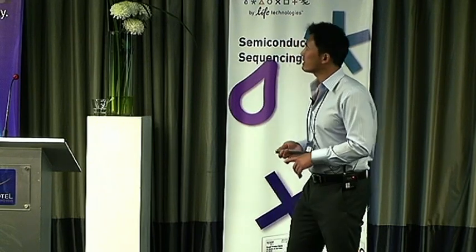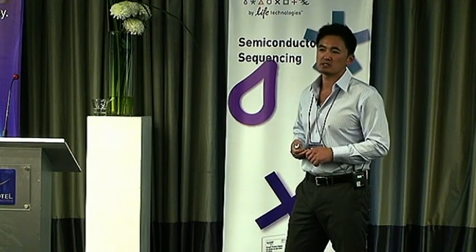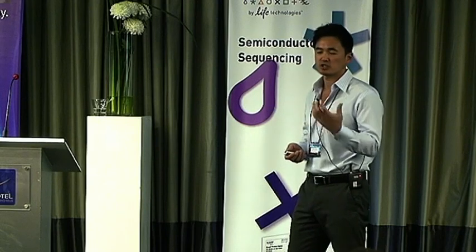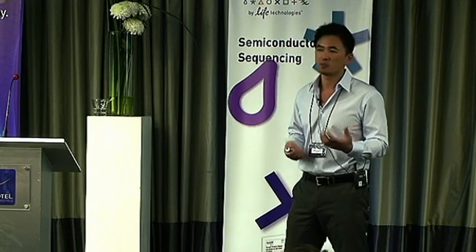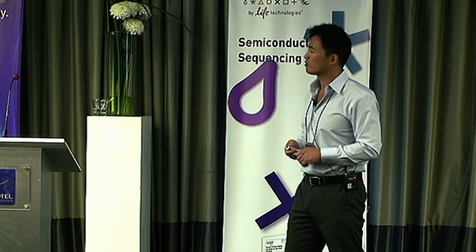So what we figured out is that there's a new generation of super bright LED lights out there now. These are the same LED lights that you're starting to see in football stadiums, right? So these are really super bright, uniform lights.